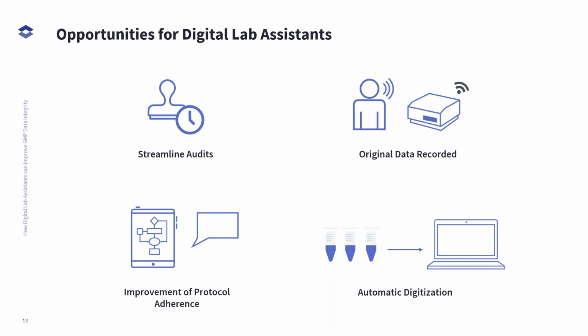Yeah, so as listed on the slide right here, we see opportunities for the use of digital lab assistants. I'd like to actually discuss the concept of original data being recorded. So I previously worked for a company. We manufactured a drug utilizing what we would call CAR-T technology. The vast majority of the manufacturing process really consisted of manipulations within a biosafety cabinet. For each step that we deemed critical, there was a requirement to document these activities as required by GMP in our batch record, for example.